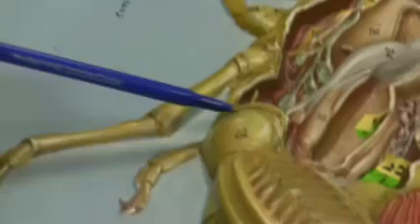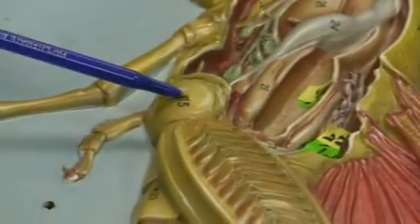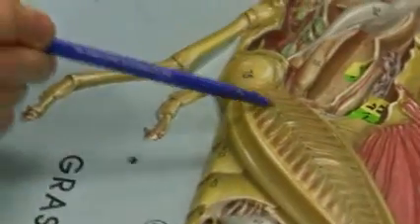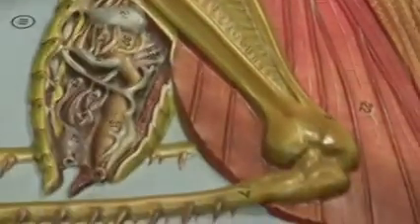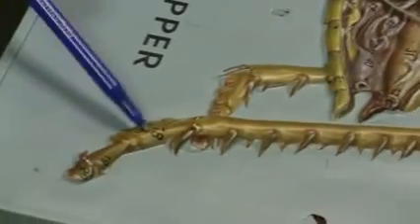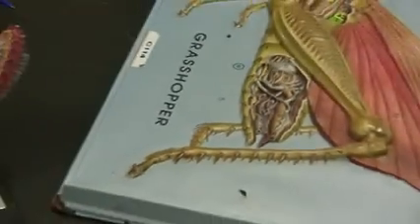But your textbook and your lab manual have it differently. But anyhow, let's follow this one. So let's call this one coxa. Trochanter would be this one. Coxa, femur, huge femur, and then tibia. And then you have the tarsals and the claws. They call them the claws.